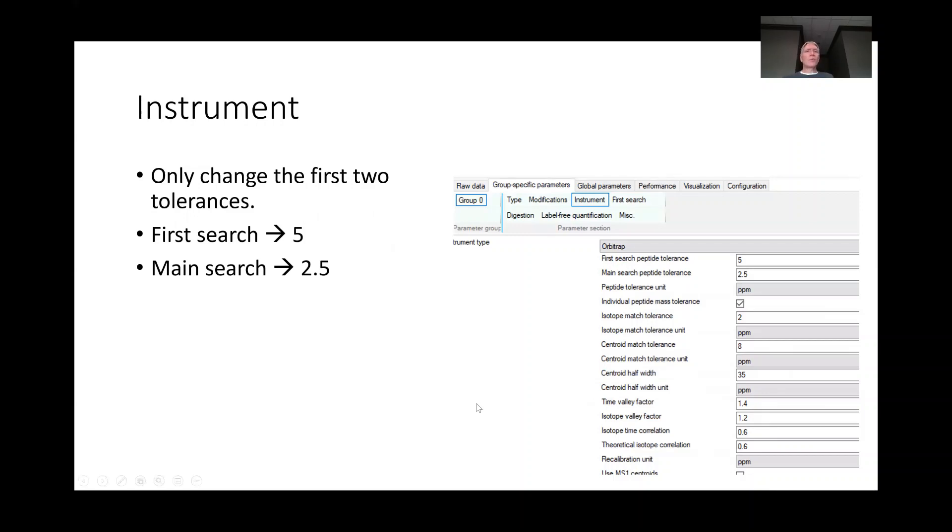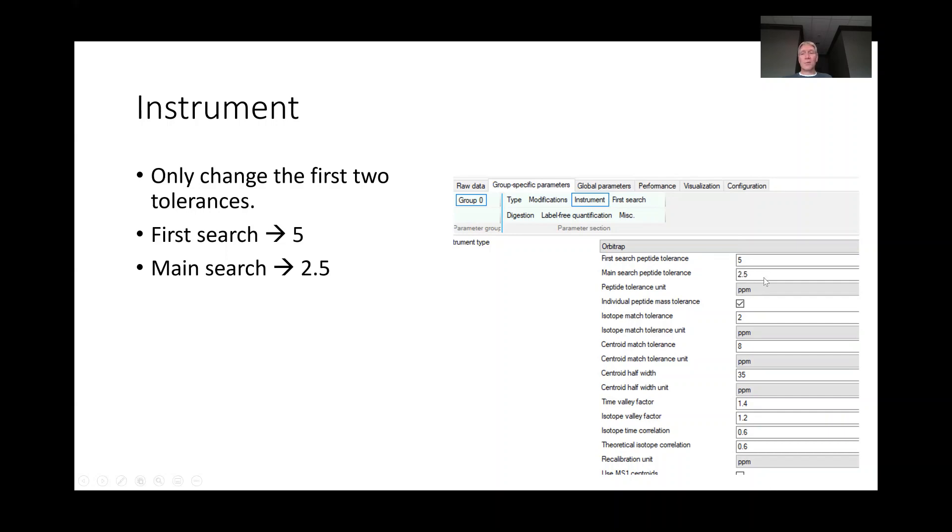For the instrument parameters, we tend to leave most of the MaxQuant settings the way they are, but we like to change the first search peptide tolerance to 5 and 2.5 for the main search peptide tolerance for the Orbitrap that we use.